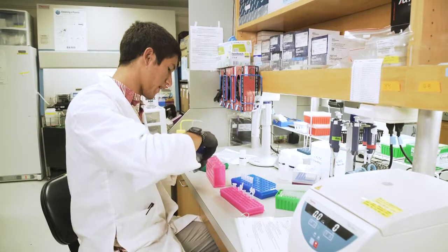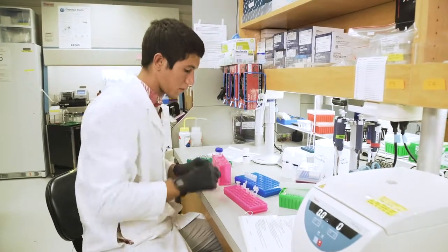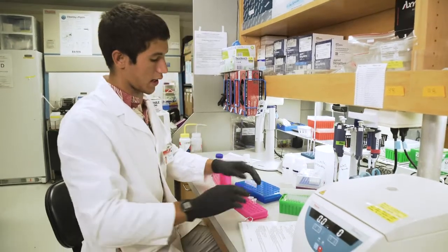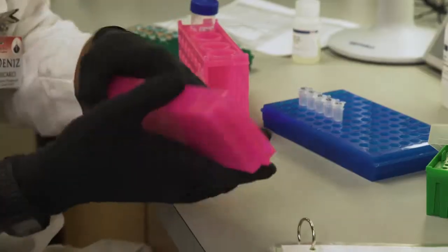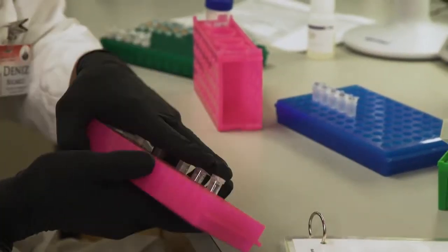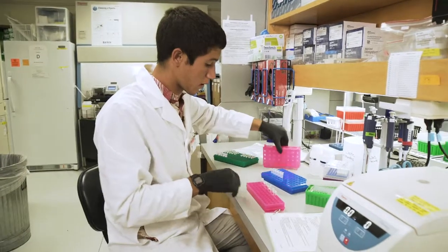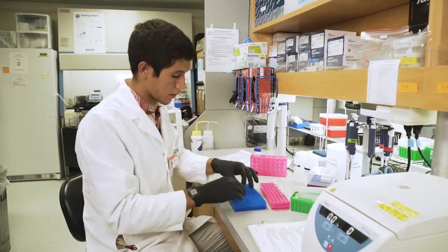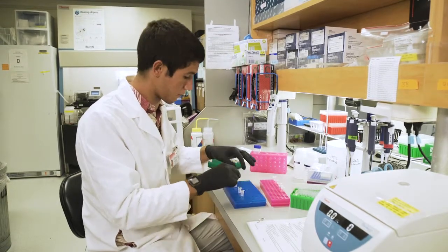So ethanol has been added, and just about after every step here, after we add anything, we go ahead and mix by inversion again. So there we go. We're going to do this 20 times. All right. So now we're going to move from these tubes to our filter tubes.